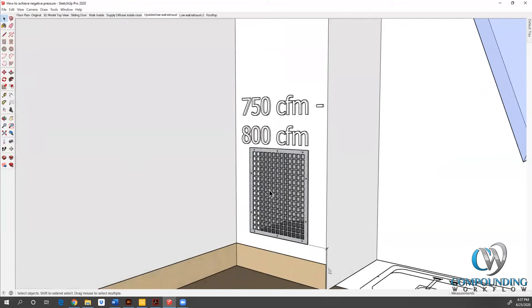This just happens to be called a lattice style. I like these because I think they're easier to clean than those horizontal east to west curved slats, which will cut your gloves and sometimes your fingers and they're just not easy to clean.